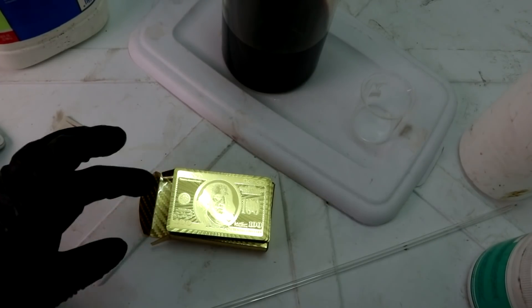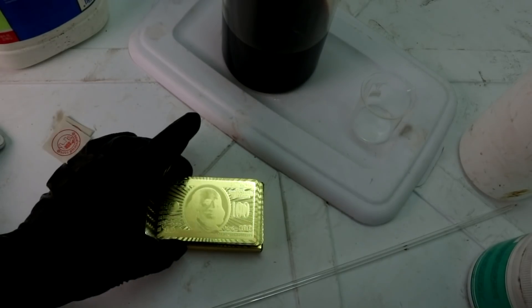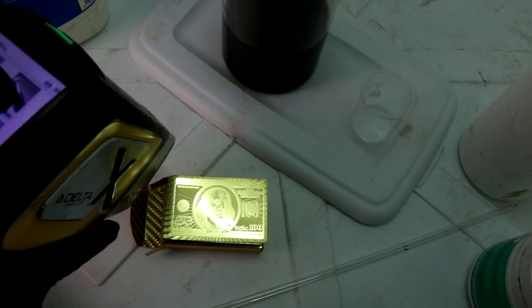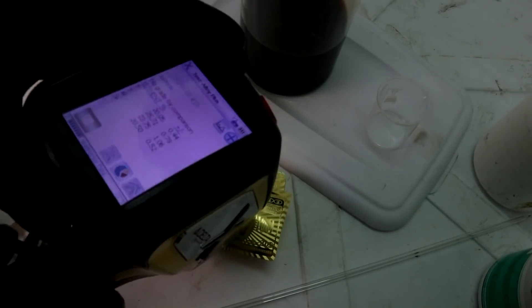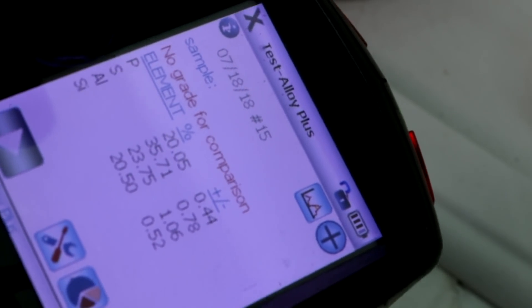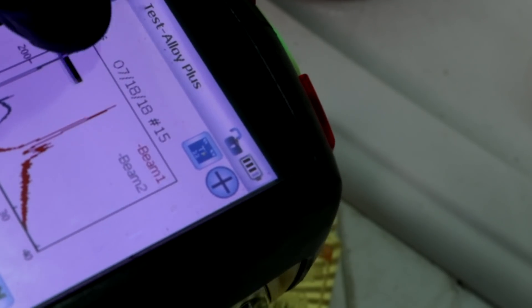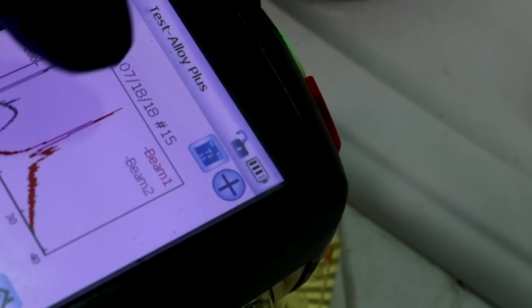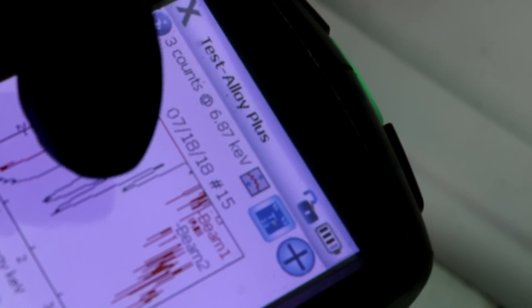I can test that with the x-ray. Aluminum is on the lighter end of the things that I can detect with that. In fact, it doesn't do it very well, but I should be able to confirm whether it has aluminum or not. I'm going to have to change modes on this and it'll take a little longer for the test to happen. Okay, so this is telling me that it's got some phosphorus, sulfur, aluminum, and silicon. Keep in mind the lighter elements will not show up on this. If I zoom in here, let's see, what is that high peak? Okay, that's chlorine. Aluminum would be down closer to zero. So this peak right there is the aluminum. So it does have aluminum in it. This tells me that it, well, it doesn't rule out the anodized aluminum theory.